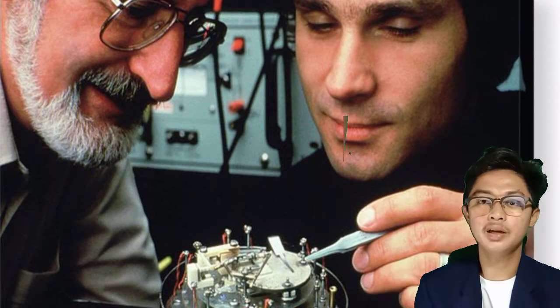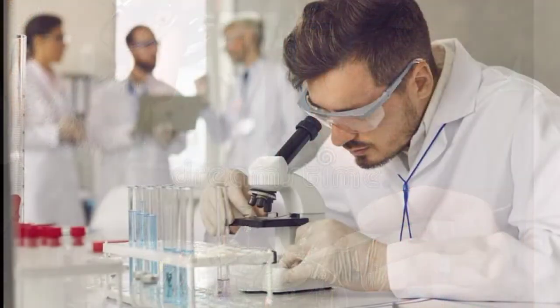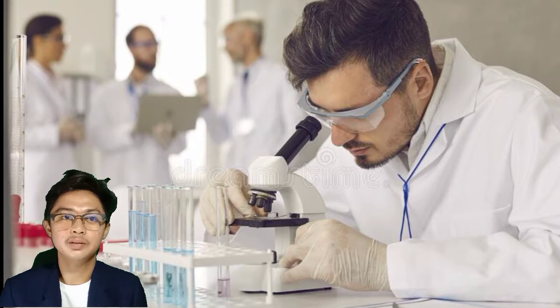In 1981, a 3D specimen image became possible with the invention of the scanning tunneling microscope by Gerd Binnig and Heinrich Rohrer. From the year 2000 up to now, emerging microscopes are being invented.